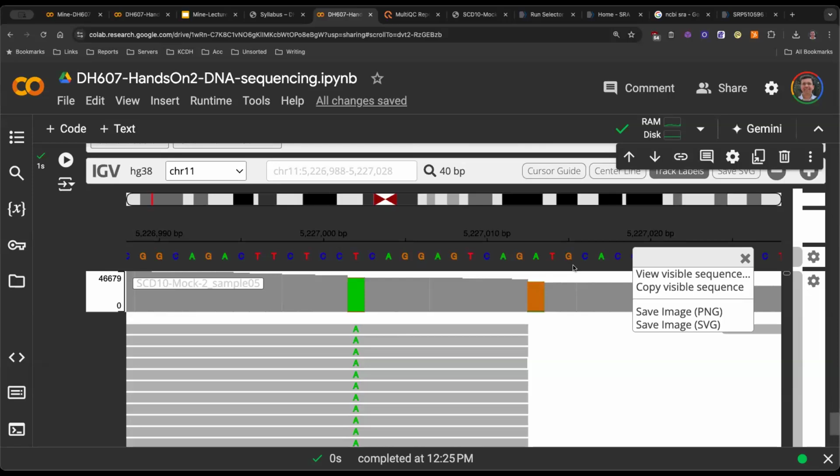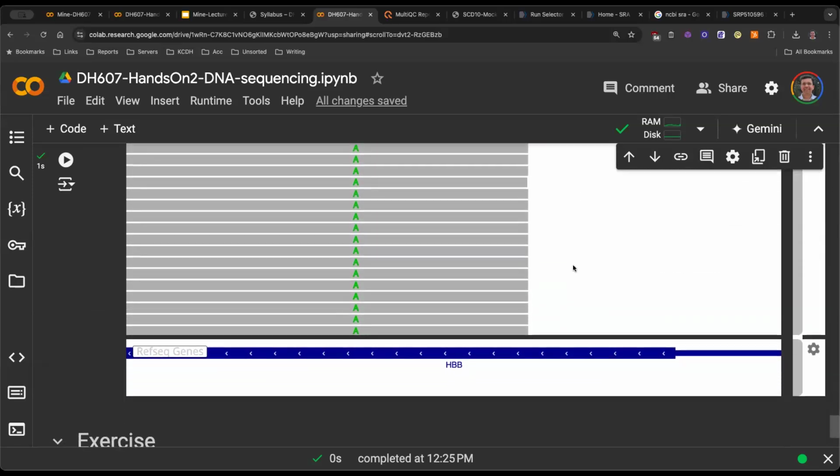I also told you what likely went wrong. So this is a sequence. The sequence is fixed. It's based on this idea that everything moves in this direction. But this gene moves in the other direction. So definitely we have a mutation in this data. There is one mutation very, very clear to see. Problem is that mutation is likely wrong.